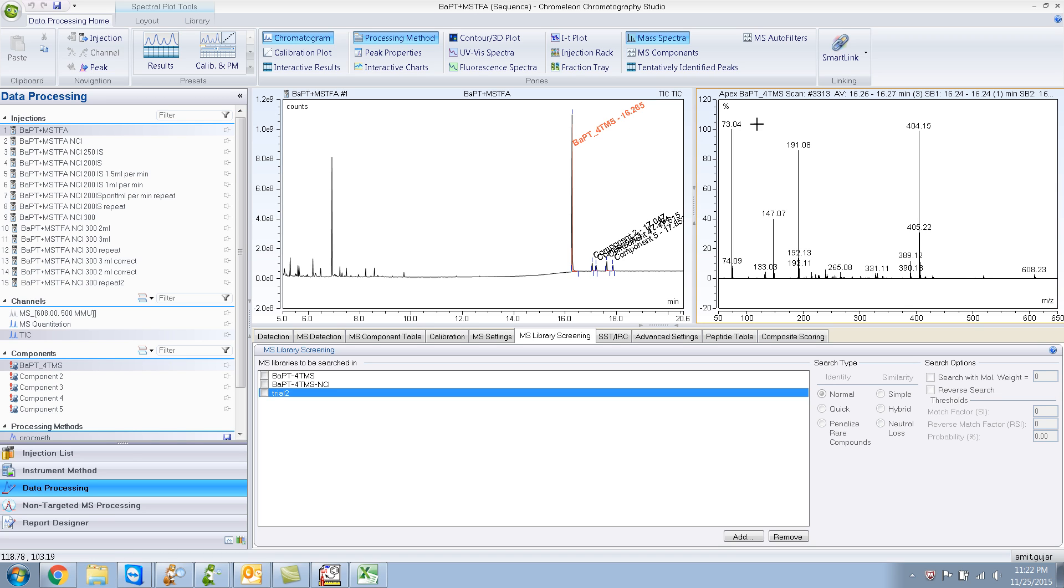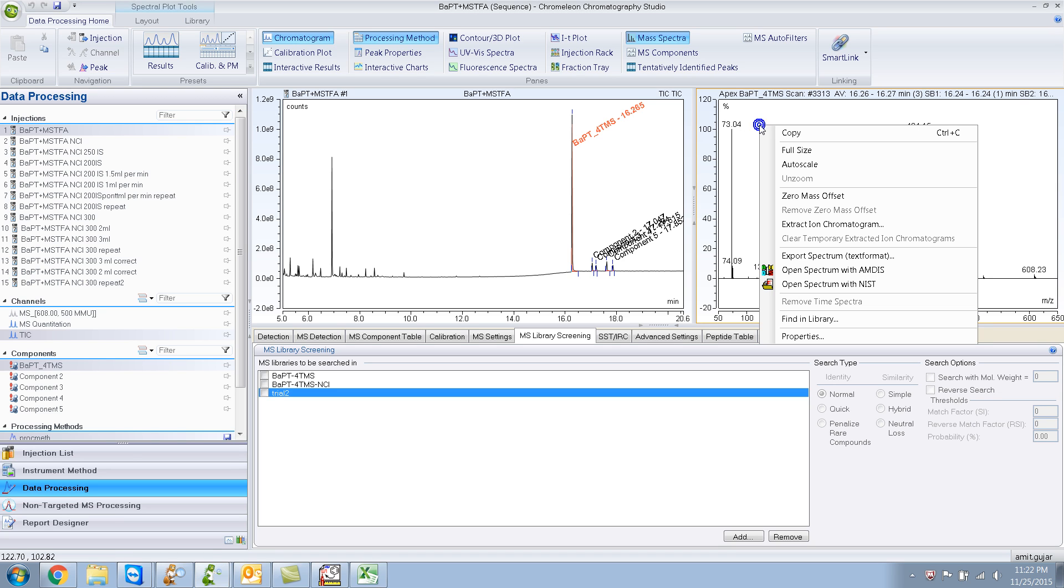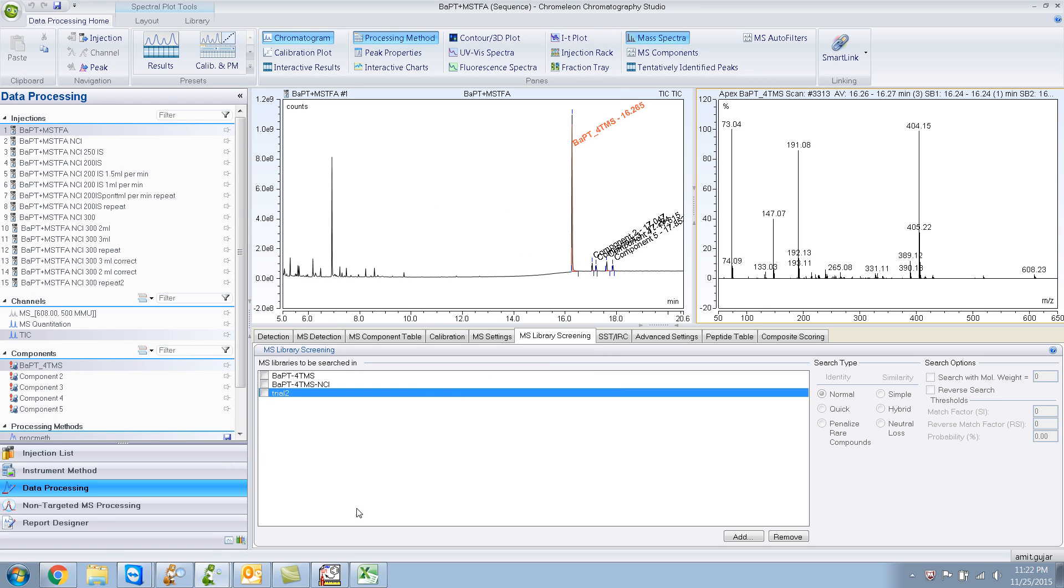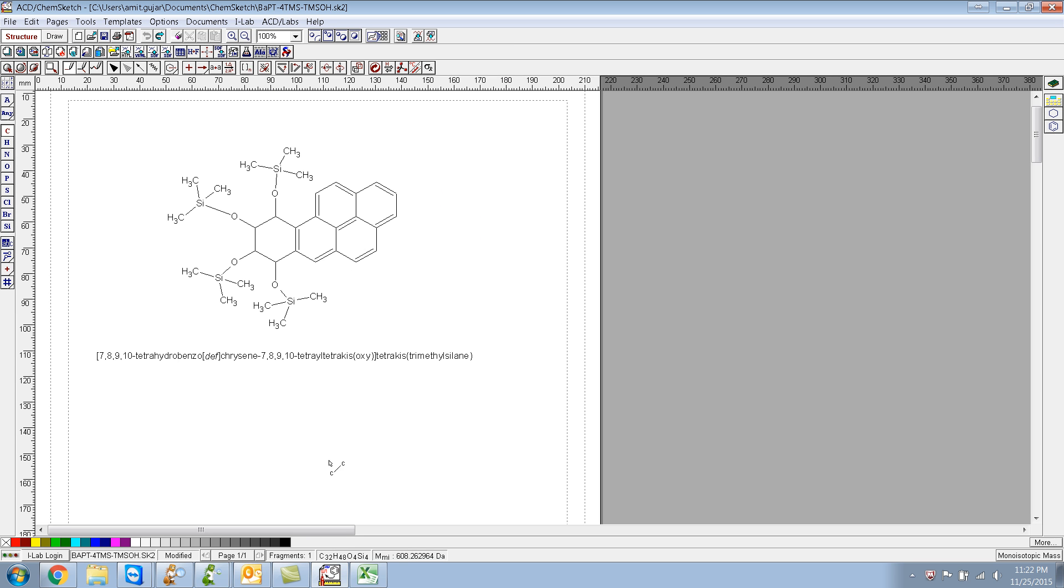So if I do a library search like this, it gives me a poor hit. And I'm sure that this is not the compound that I'm looking for. So the compound that I'm looking for is this one. It's benzene apyrene tetrol, the 4TMS derivative.